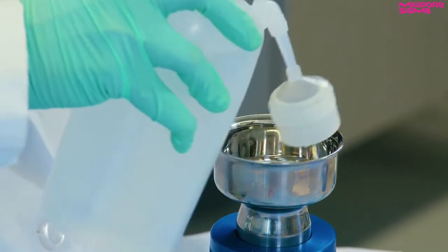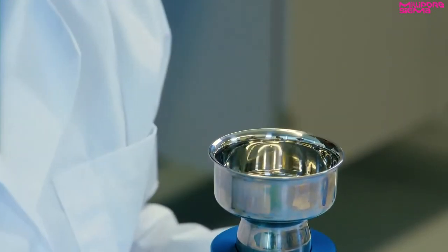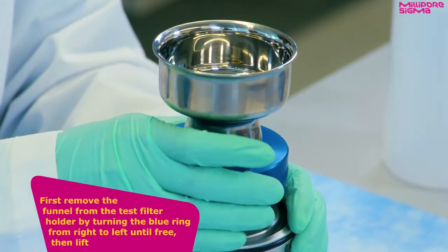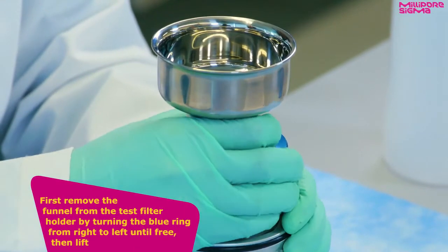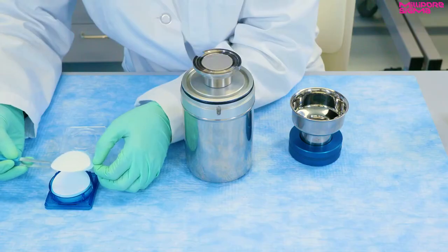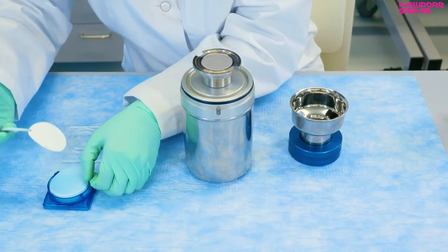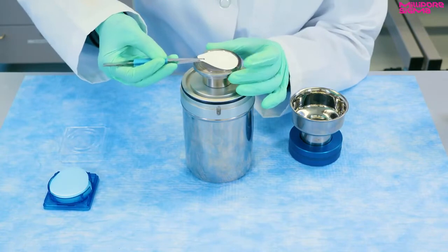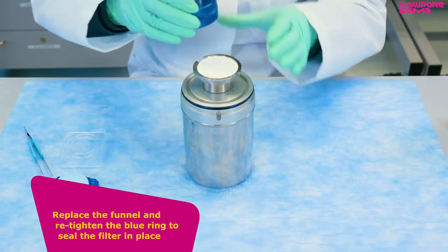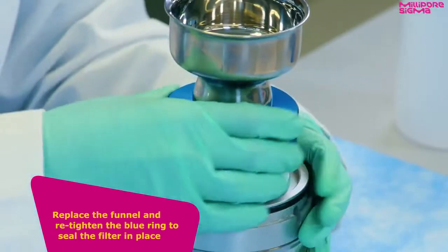To install the test filter, first remove the funnel from the test filter holder by turning the blue ring from right to left until it's free and then lift. With your forceps, center a 47 millimeter white test filter disc on the wire mesh support screen. Replace the funnel and re-tighten the blue ring to seal the filter in place.